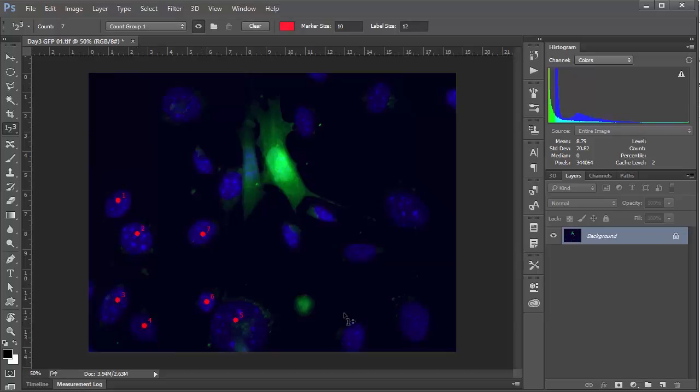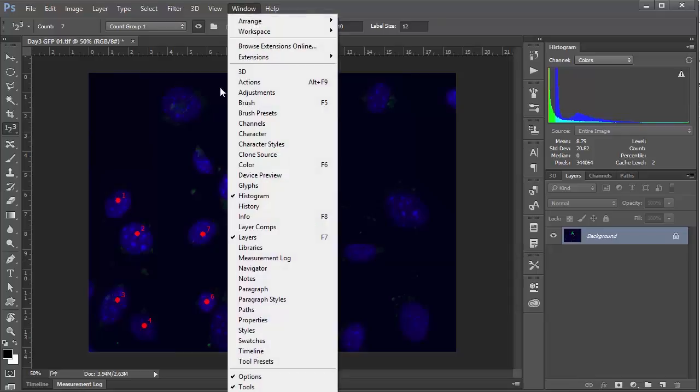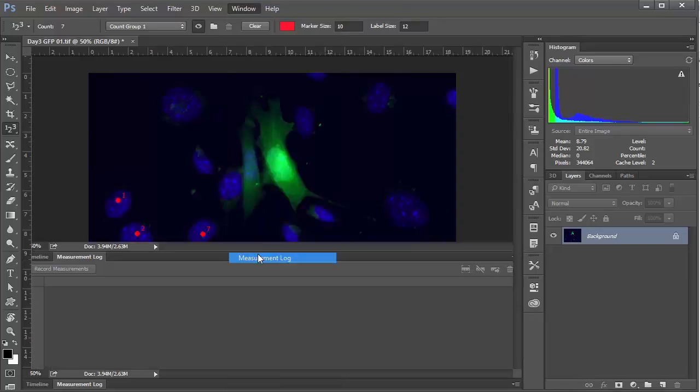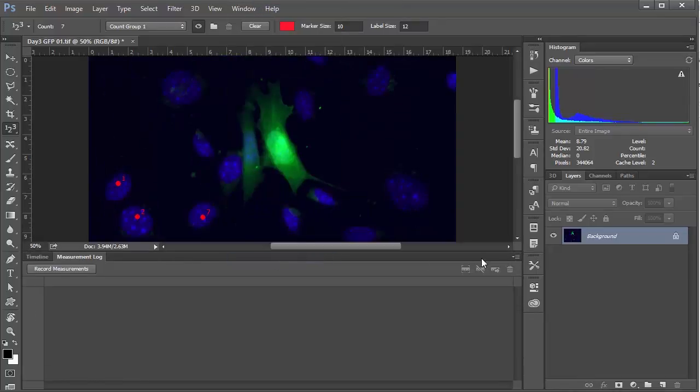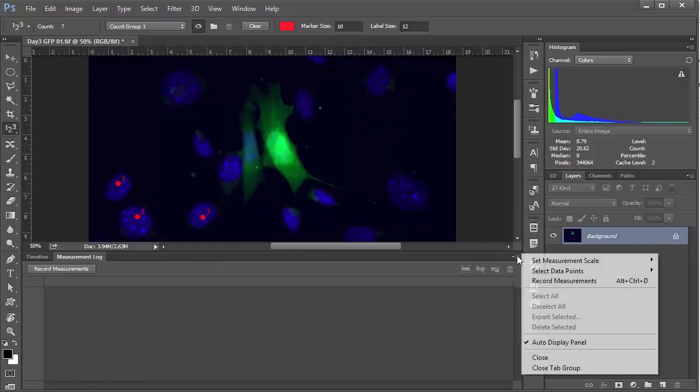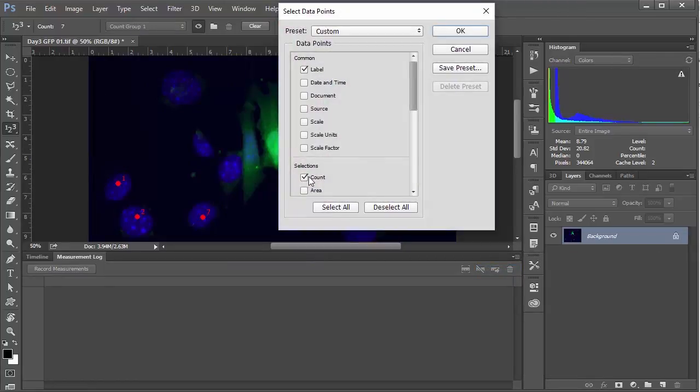If you're happy with that selection and you want to save it for analysis later, what we do is go up to window and choose measurement log, and then we'll click on this little hamburger menu and say select data points and choose custom.